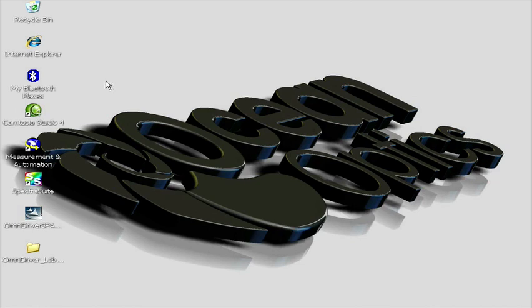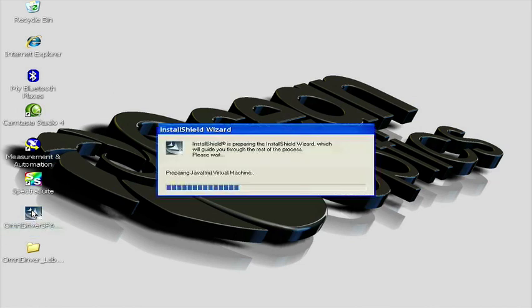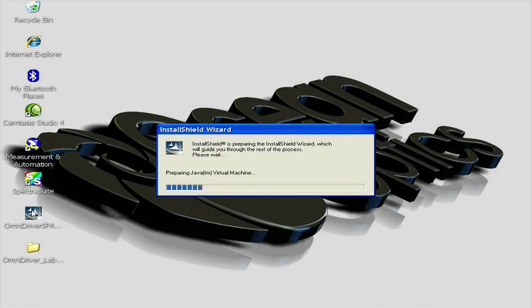Once the installer is downloaded, navigate to the directory where you saved it and double-click on the icon.